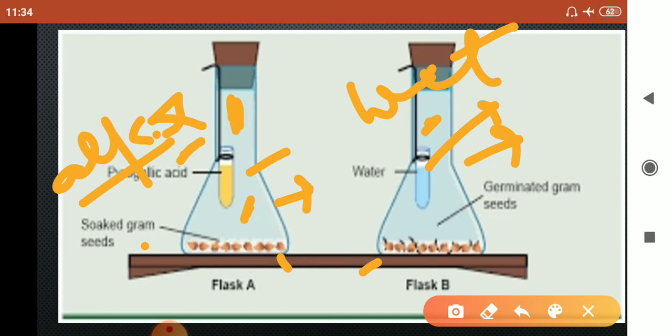Where the oxygen is absorbed, the seeds will not be able to germinate because they will not be able to get oxygen. What happens in the other flask? The seeds will germinate. This experiment proves that oxygen is necessary for germination.